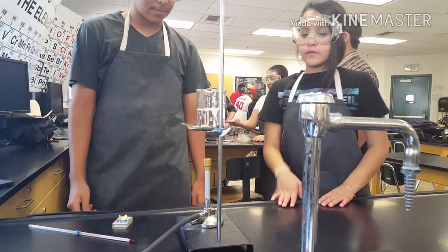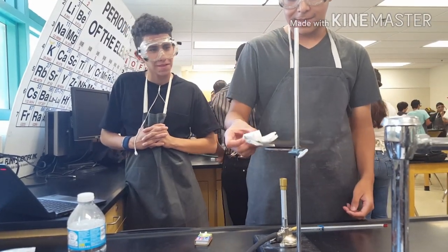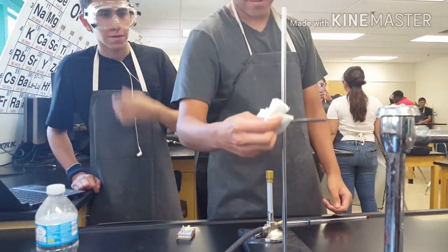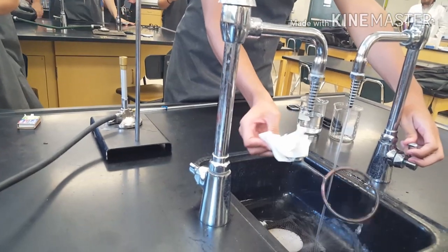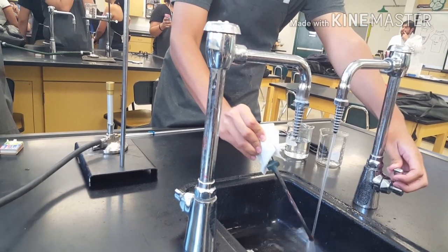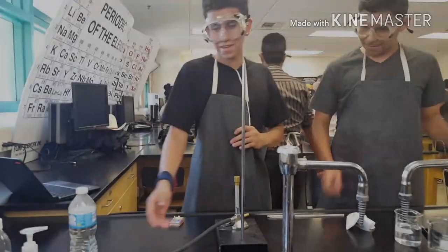Just be careful to remove everything with the tongs. Once you're done, you can take this off with a towel and pour water on it because it's hot. Once you're done, you can take off the iron ring. Be very careful because it's hot. You can cool it with water. You can take the Benson Burner off.